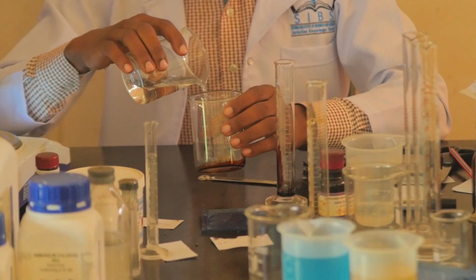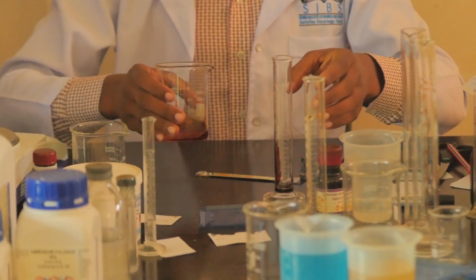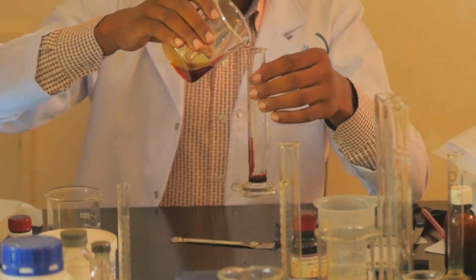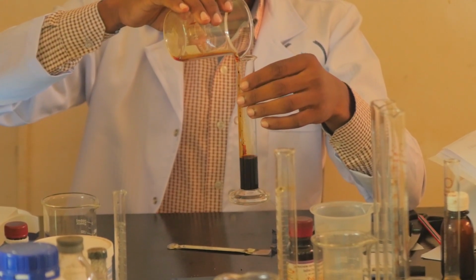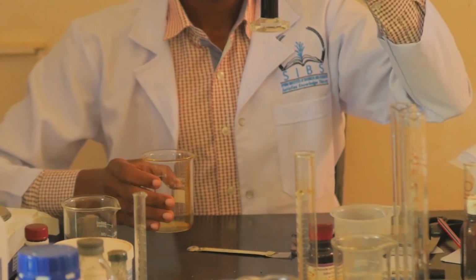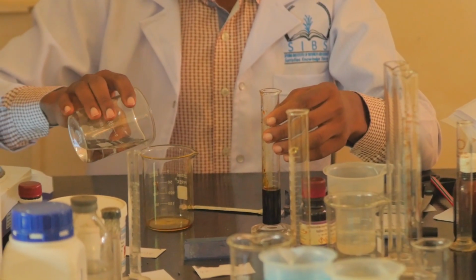So now let's add. Considering the meniscus, it's not yet 20, so add some amount of alcohol.